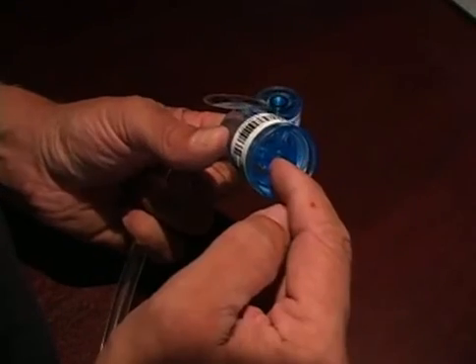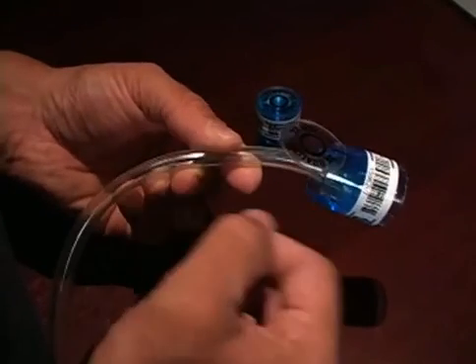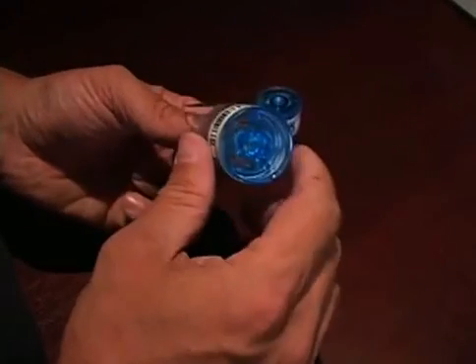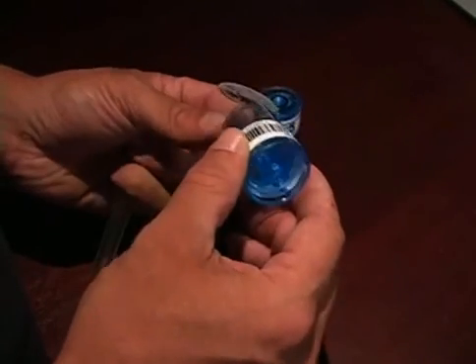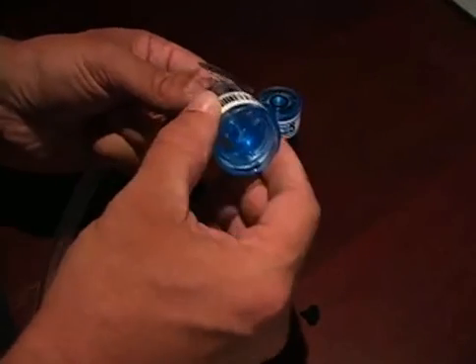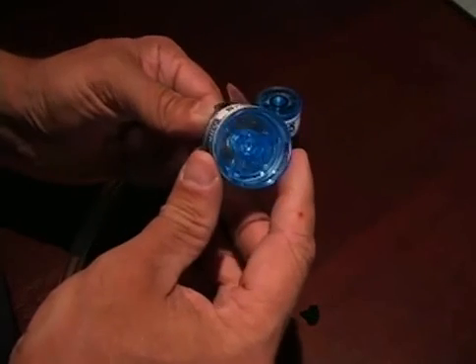Turn on the pump, sample for 5 minutes, or depending on the environment, let's say 8 to 10 minutes outside, recommended by the manufacturer. Indoor with normal activity, 5 minutes. Indoor with heavy particulates, like someone's cleaning or dusting, maybe 1 to 3 minutes.